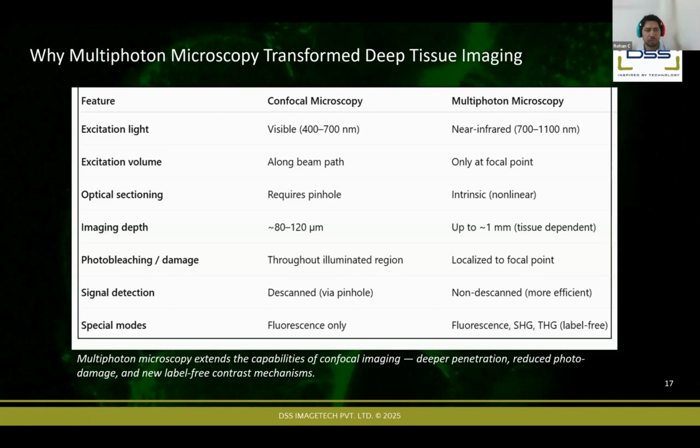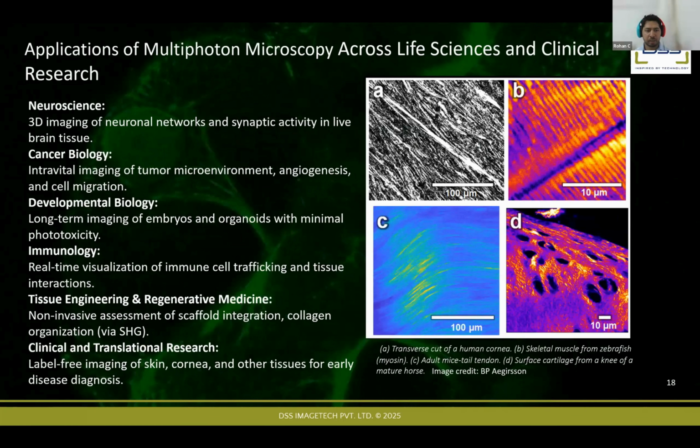That is the only advantage, that multi-layer tissues we can examine in one place using fluorescent dye. What about this three-photon and two-photon? As you told, we can visualize label-free. How much structure can we see label-free? So, if you compare, for example, collagen labeling with an antibody to the label-free imaging, the antibody labeling or labeling with a dye to collagen will give a lot better contrast and a lot better specificity. Here in label-free, we don't get that kind of specificity.